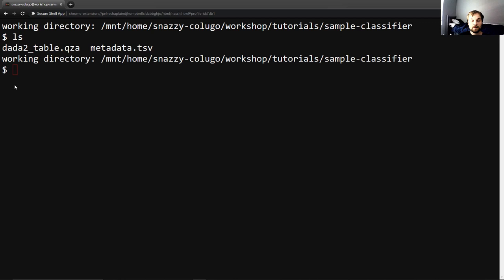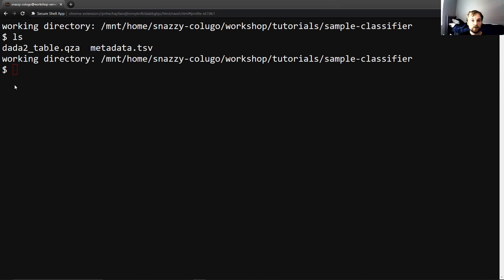Hello, my name is Anthony Smarr and in this video we will be going over the sample classifier portion of the QIIME 2 Parkinson's mouse tutorial. This video will generally assume that you've been following the tutorials up to this point and also that you've watched Jess and Ariel's lecture video on sample classification because in this video we will be discussing how to actually implement some of the ideas they discussed in QIIME 2.